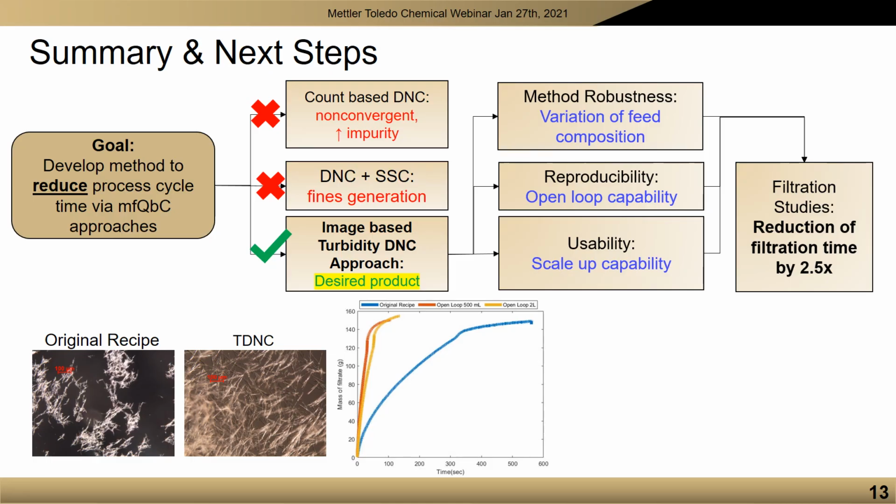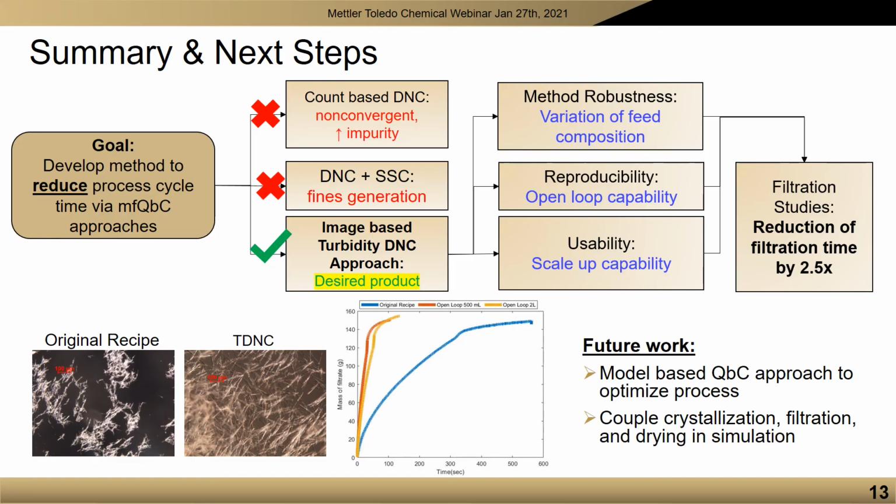For future work, we would like to propose a model-based QBC approach to optimize the crystallization process while investigating scale-up approaches with coupled filtration and drying.